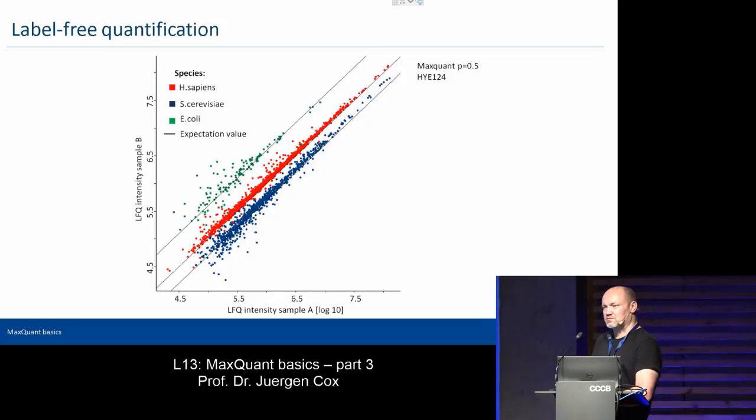And for ion mobility use? I think it would not work without further work on our side on Waters-specific elements, because it's not exactly the same way that Bruker and Waters are doing this. So I would not recommend it.